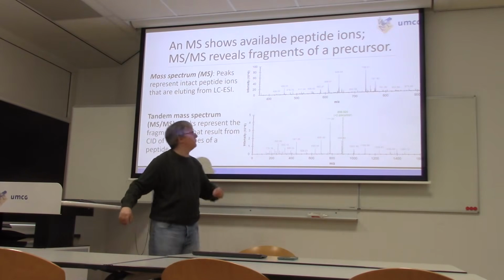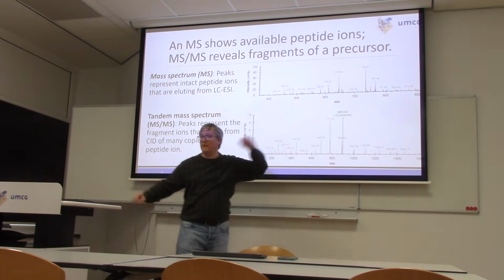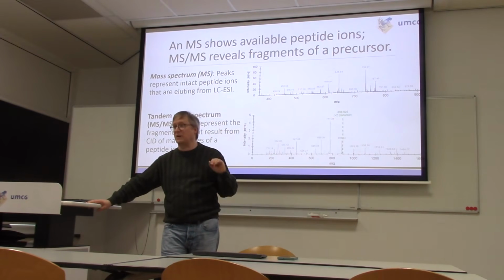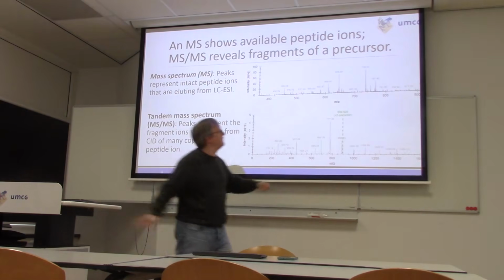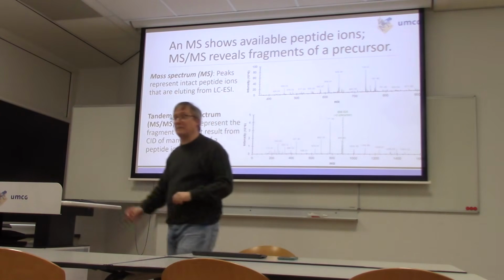Okay, good question. All right, so this is what the instrument saw, the mass spectrum, when it was trying to decide which tandem mass spectra it would generate. And it looked at these ions and said, ooh, there's a nice peak over there at 735, right here. Maybe I should sample that in an MS-MS.